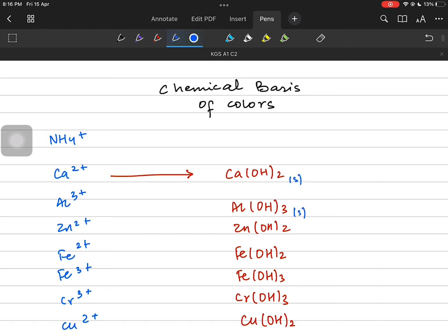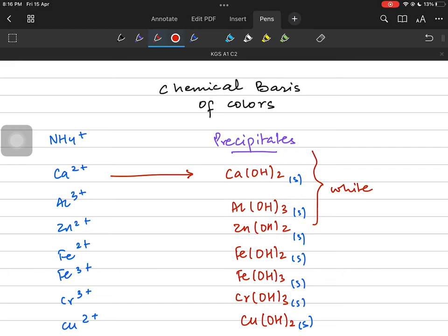These are the precipitates that you receive. The colors that you get in the precipitates belong to these chemical substances. The precipitates are actually the metal hydroxides, which are insoluble. The precipitates are a specific color for a different reason, but their solubility is something else. Iron has green or red-brown precipitates based on the oxidation state of iron. Chromium hydroxide is green, copper hydroxide is blue.